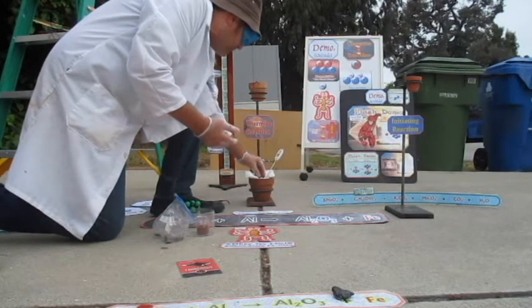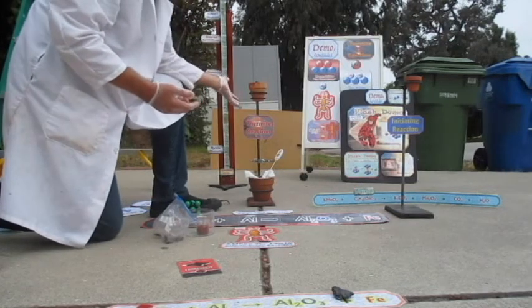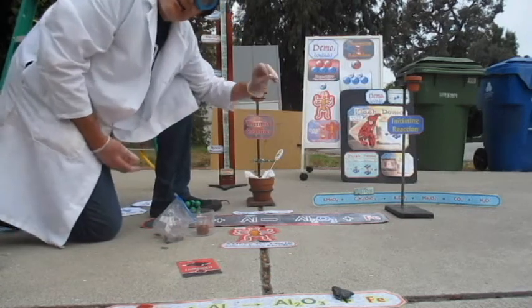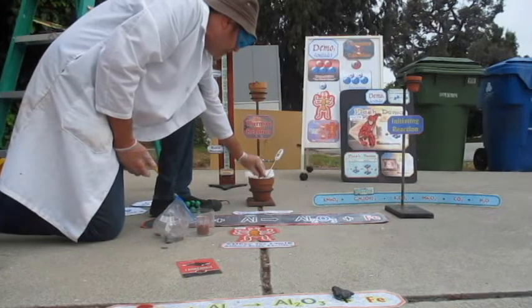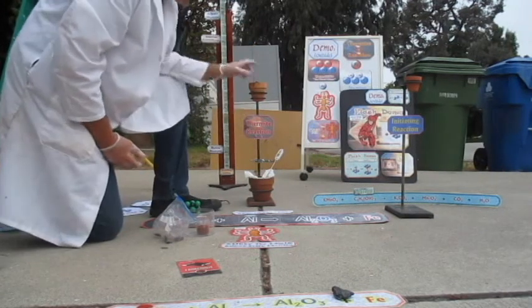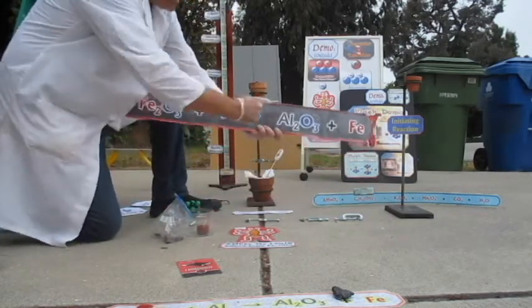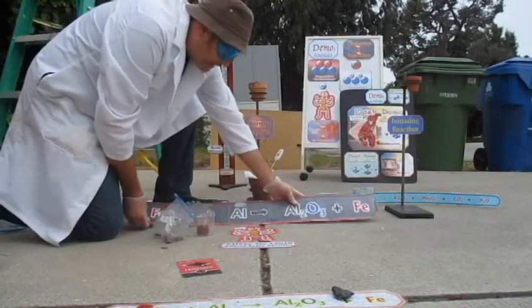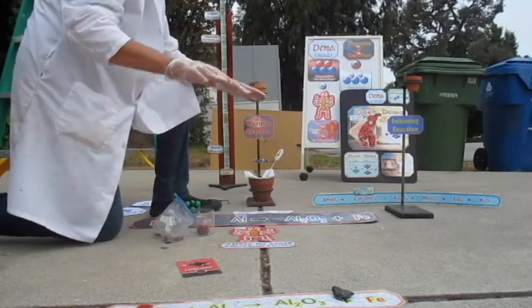So we'll have a little bit of platinum, a ring, like if this is Mount Doom, because this is going to come out as hot as lava, maybe it'll melt the ring or just start to melt the ring. We'll see what happens to this piece of platinum and this ionic compound, a metal and an ionic compound. They're going to be smothered with a whole bunch of the products of the thermite. The products of the thermite are going to be alumina and molten iron. They will come out at a temperature that is hotter than any lava, anywhere.